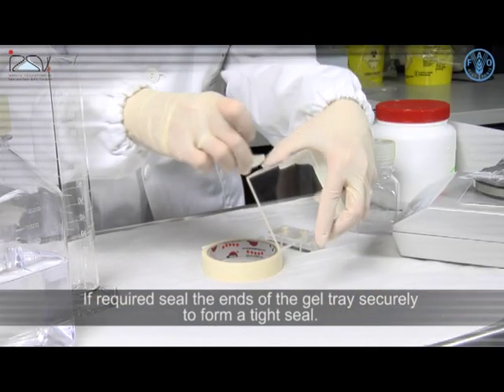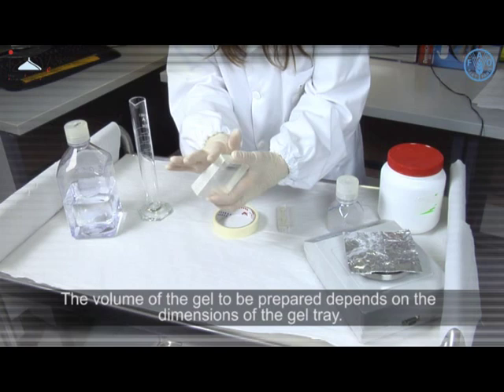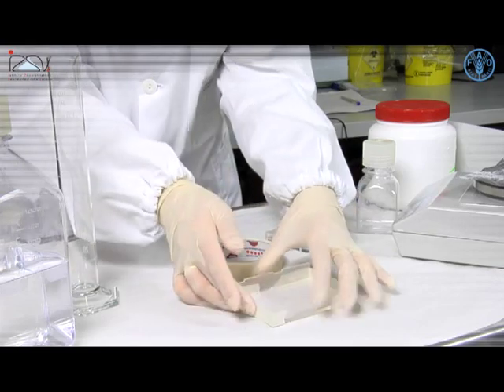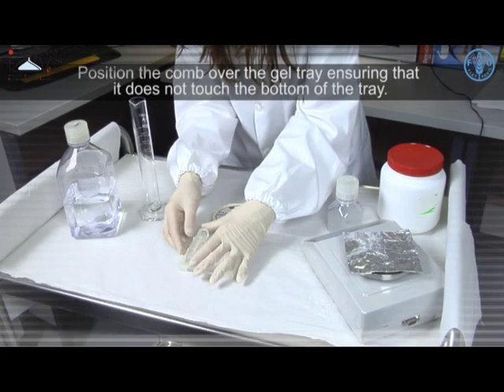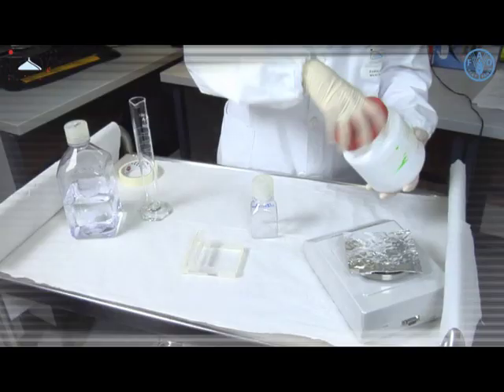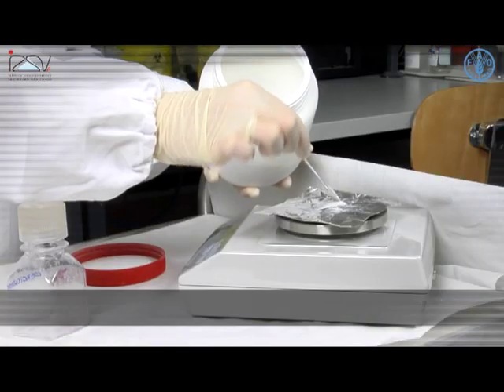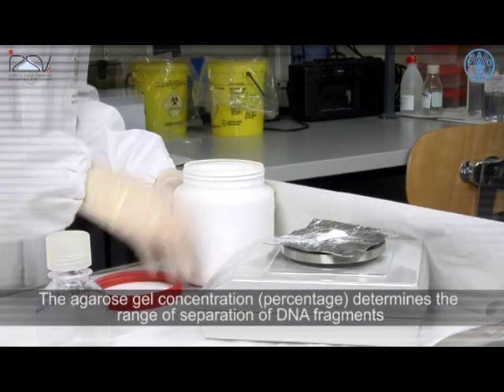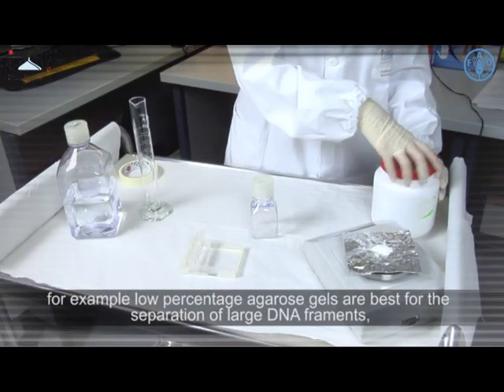Also required: a plastic bottle to mix reagents, an ultraviolet intercalating fluorescent dye such as ethidium bromide, an electrophoresis chamber, and a power supply. Assemble the gel casting tray and comb; if required, seal the ends of the gel tray securely to form a tight seal. The volume of gel to be prepared depends on the dimensions of the gel tray. Position the comb over the gel tray ensuring it does not touch the bottom. Prepare the gel on the basis of the percentage agarose required for the protocol; the agarose gel concentration percentage determines the range of separation of DNA fragments.